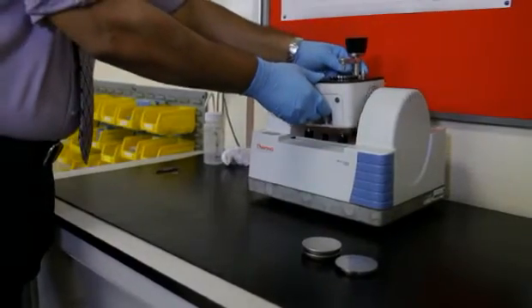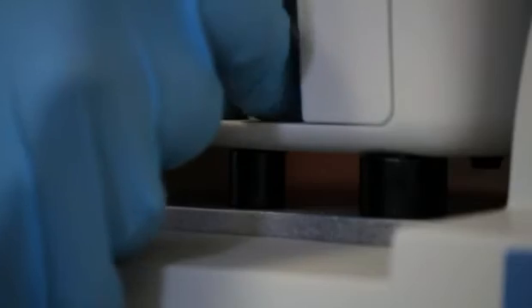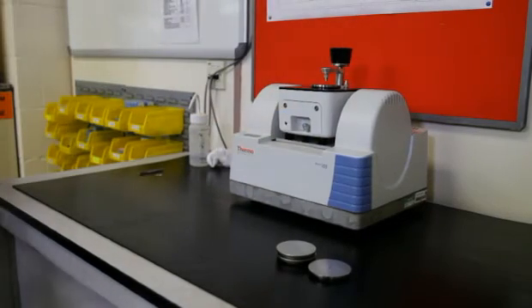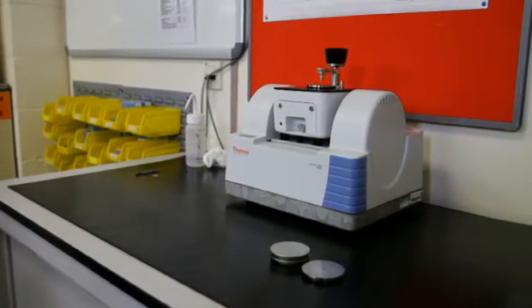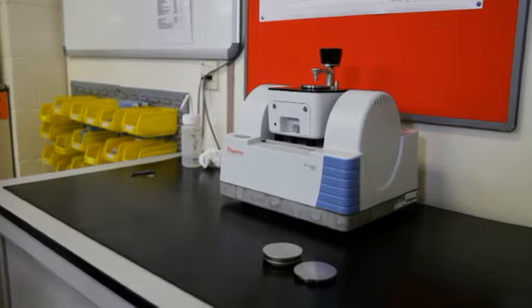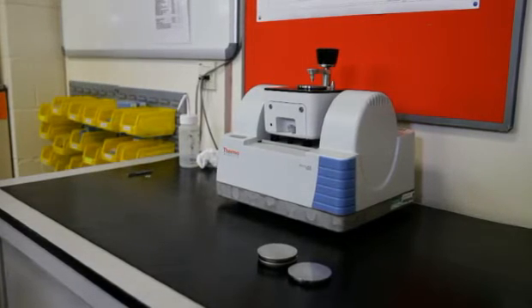The Quest ATR accessory is compatible with SPECAC's benchmark baseplate system. This means the Quest accessory is not limited to using a particular spectrometer but can be easily fitted to a range of modern spectrometers with the use of appropriate benchmark baseplates.